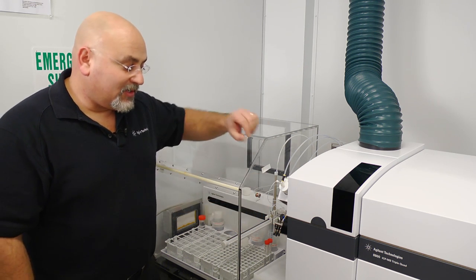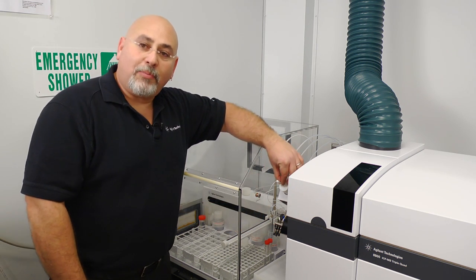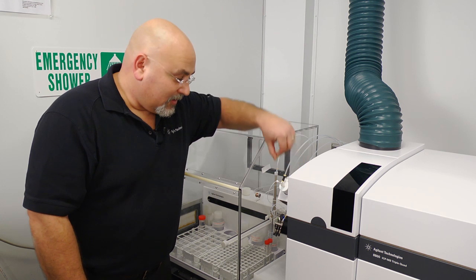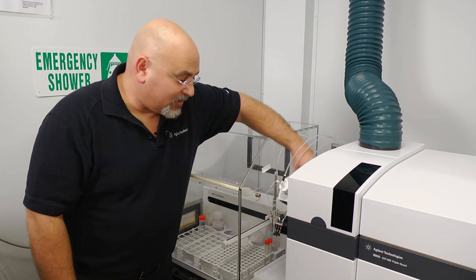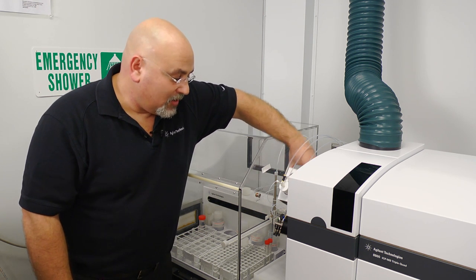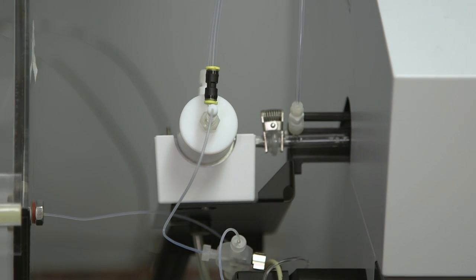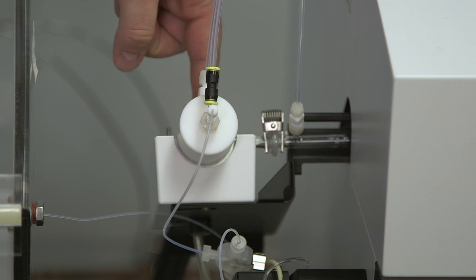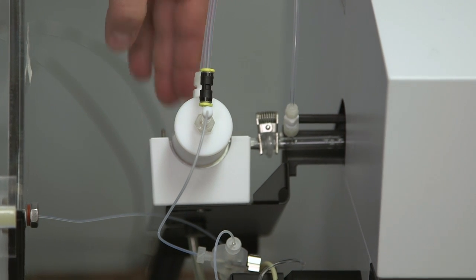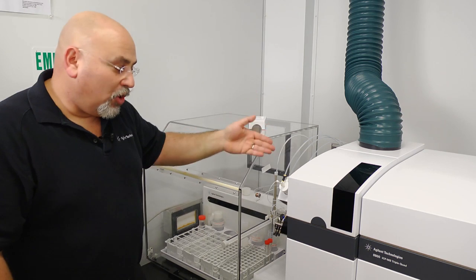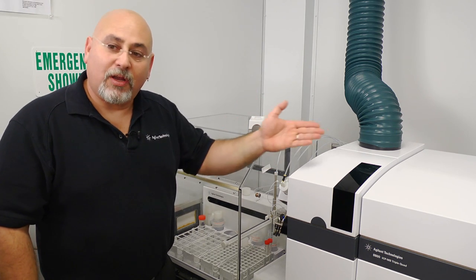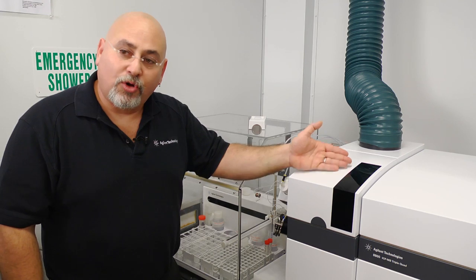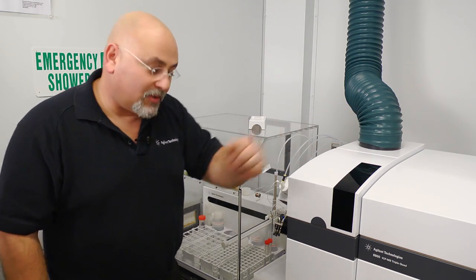The sample is then carried through a nebulizer. This is a concentric nebulizer, a low flow concentric nebulizer, which nebulizes the sample into a Scott double pass spray chamber. The small droplets then are going to be carried into the torch and eventually ionized in the plasma.